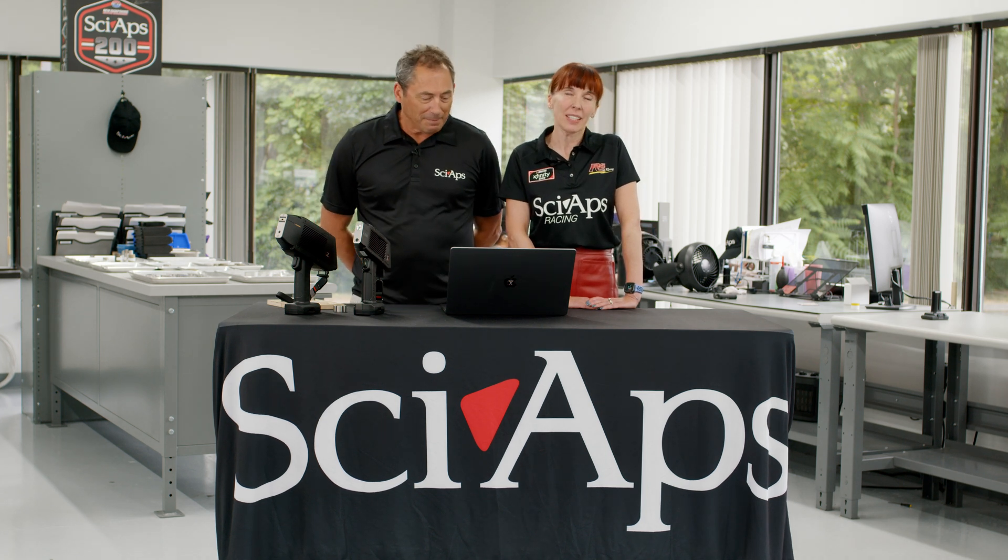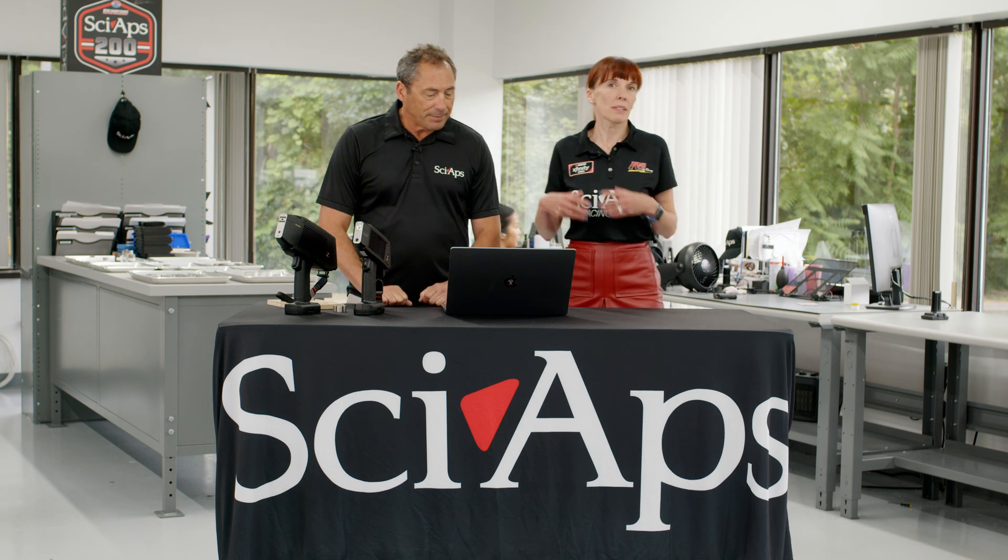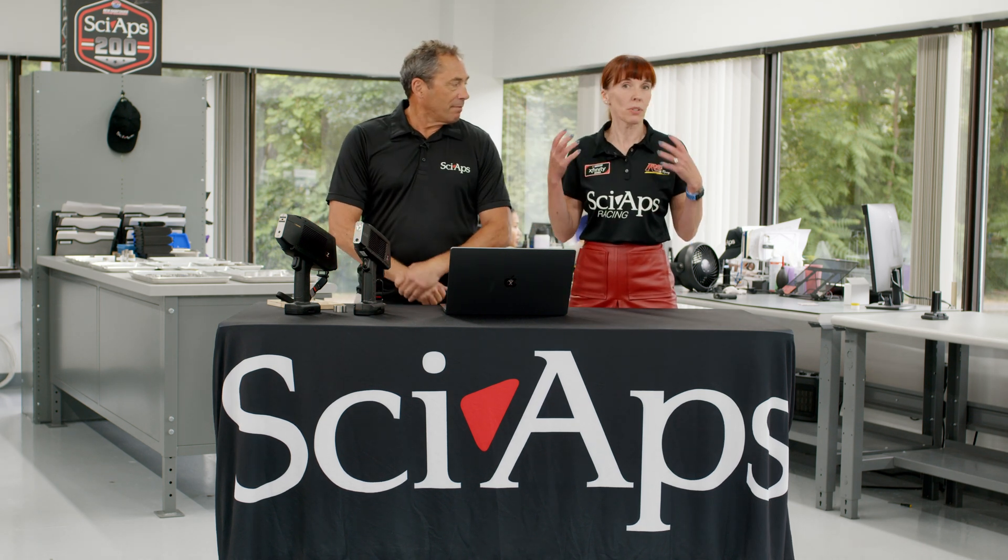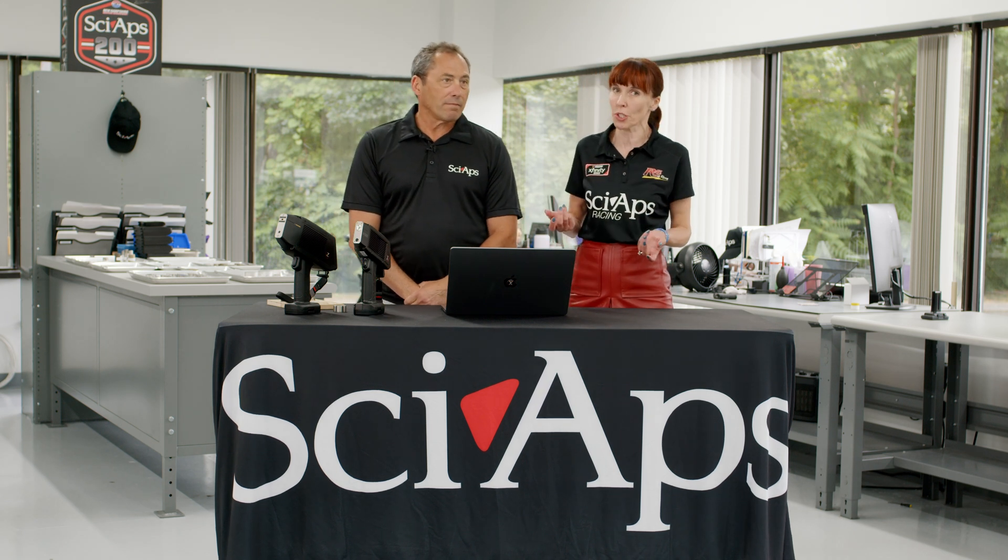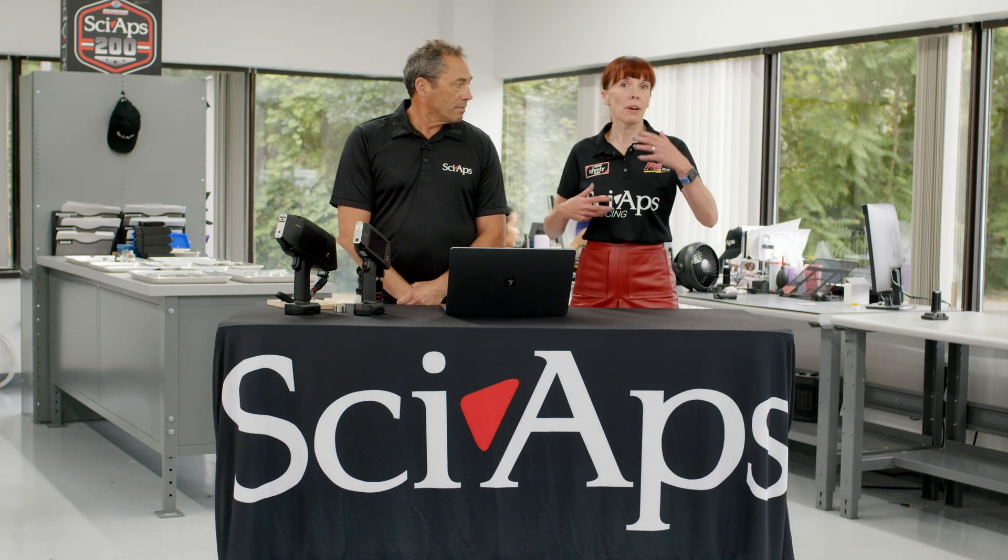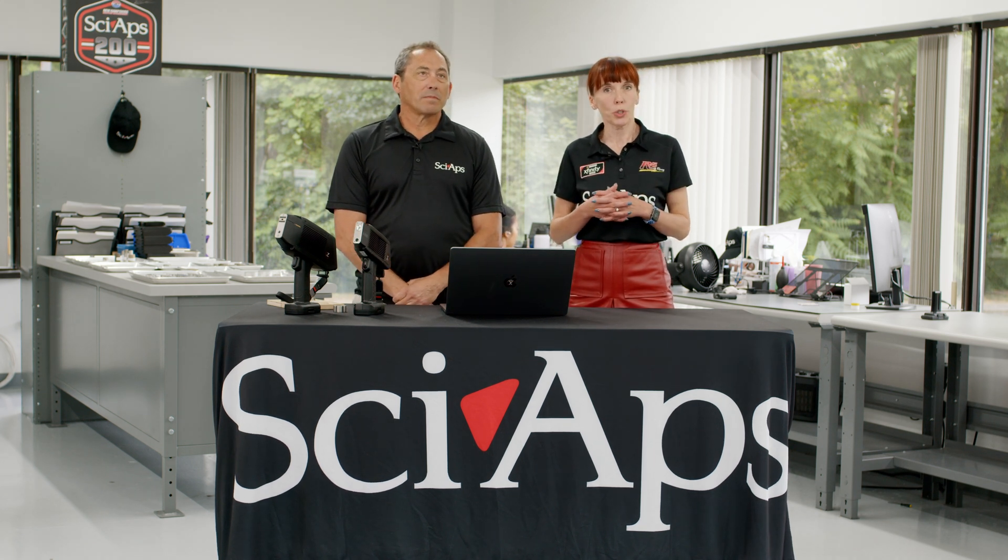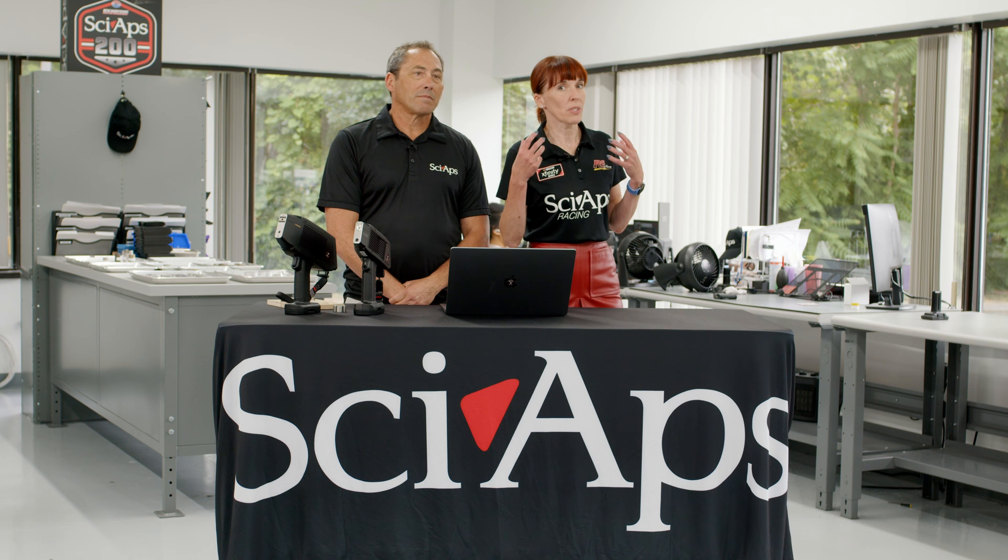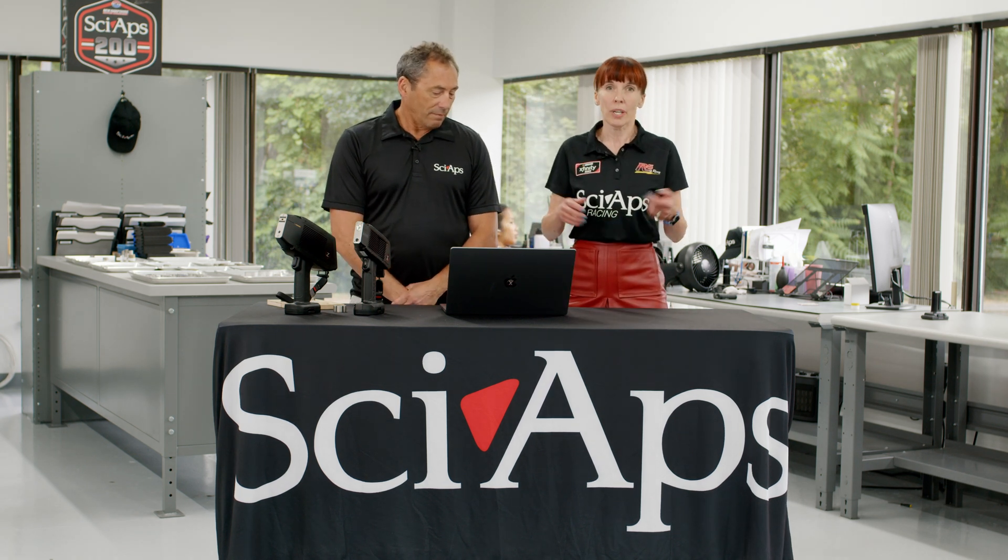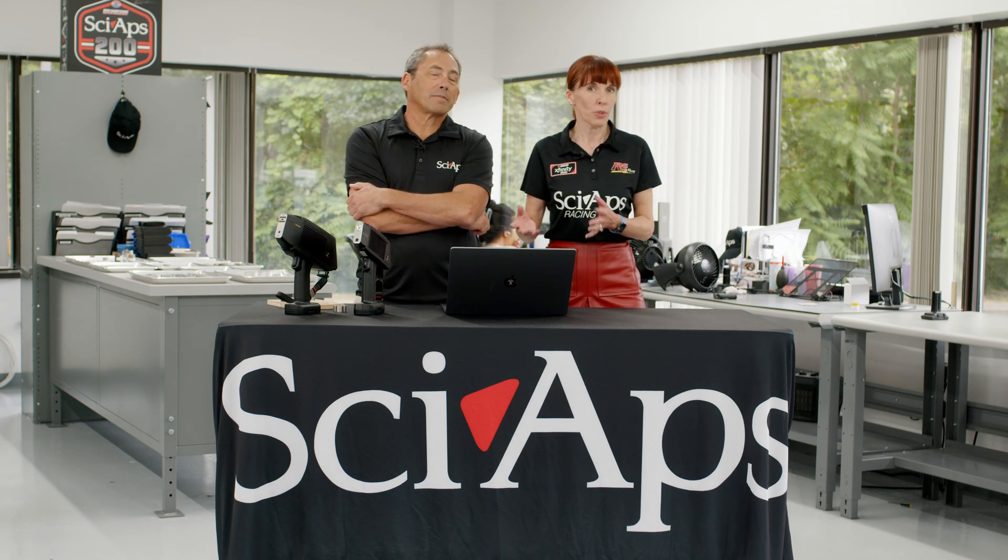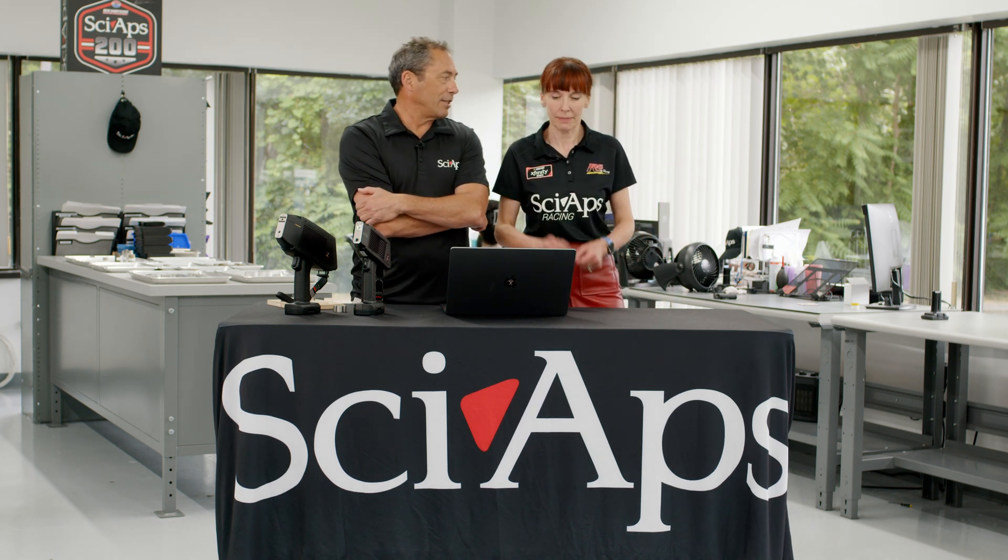Yes, and here we're talking about cloud. What is cloud? Cloud is an application for fleet management. So you have a lot of analyzers, you can connect them to our fleet management solution and you could monitor data coming from analyzers in real time. Also what you could do, you could get some statistics from your device, you could do export management. We have advanced user management system and I just want to show you some functionality right here.